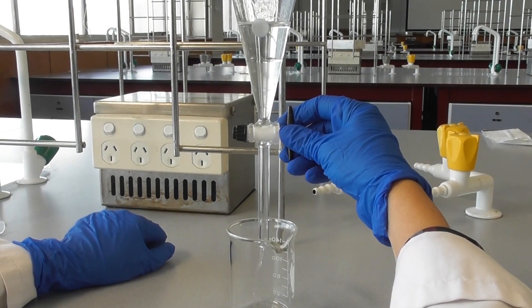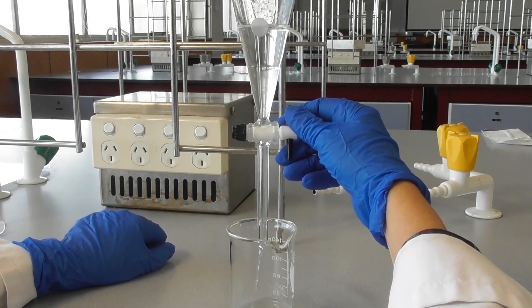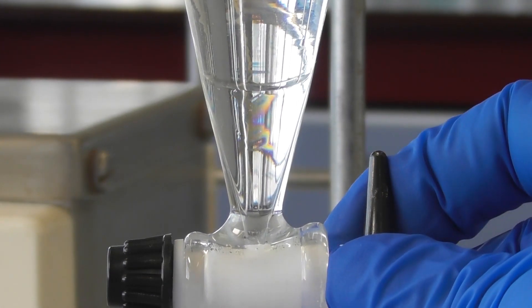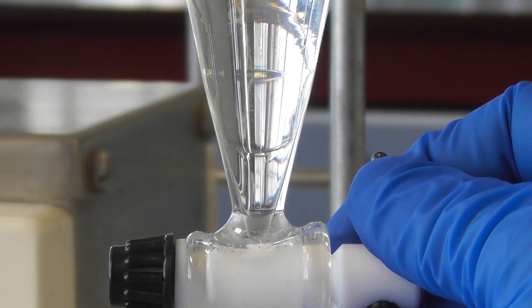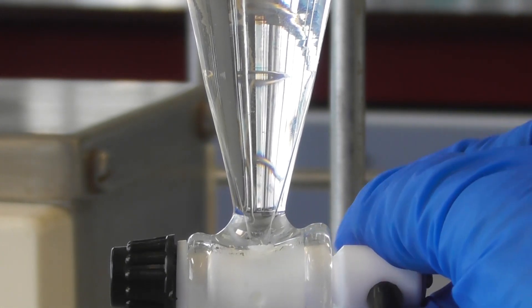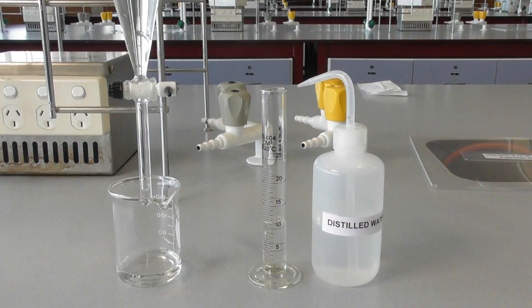Open the tap and drain the bottom layer, keeping a close eye on the boundary between the phases. Begin closing the tap as the boundary approaches it. Best separation occurs when the interface is just above or inside the tap.